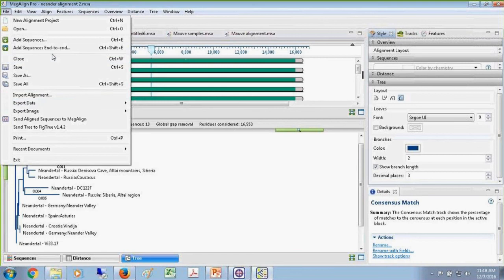And something else I want to show. So I have about 20 years of experience in phylogenetics. So I tend to make trees that are the final product, and I need to put lines in there or highlight by color or do some enhancements that I need other software to do, fine enhancements. Here I've set kind of like a rapid link to pass my tree file off to FigTree. FigTree is just free software, has some enhancements I can do with the final tree to make it more, I guess, some final enhancements that I'm looking for.